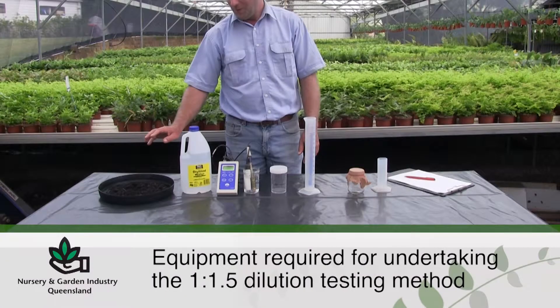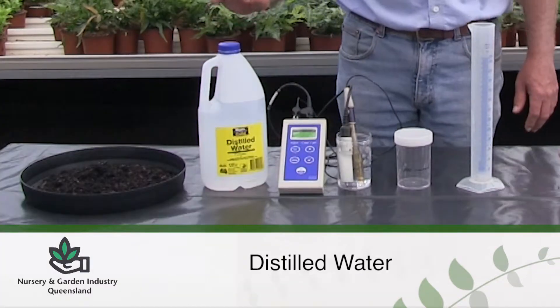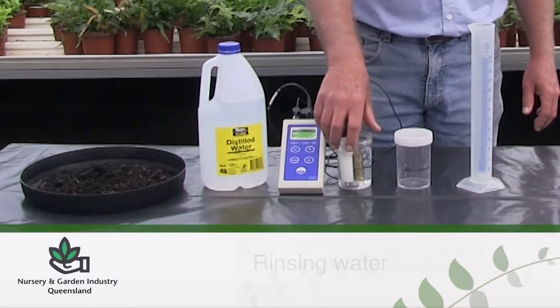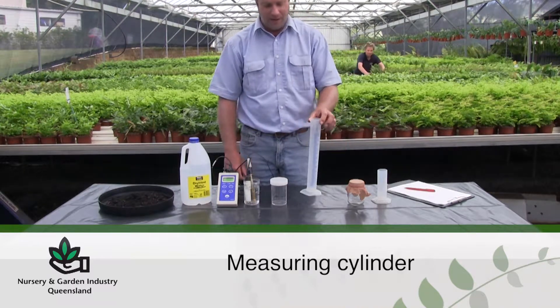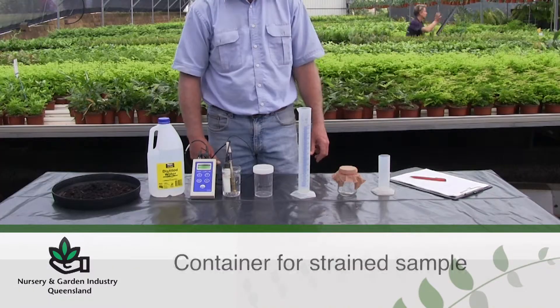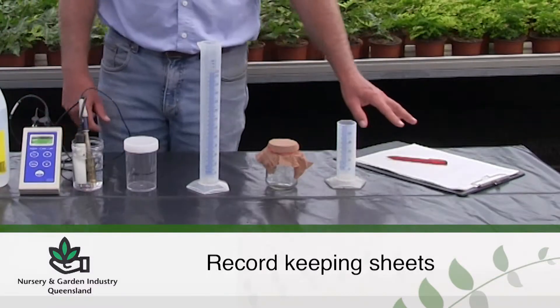The equipment required for an EC and pH test is: a growing media sample, distilled water, a pH EC meter and probes, rinsing water, a measuring container, a measuring cylinder for measuring water, straining equipment which is a container with stocking and rubber band, a container for holding the strained sample, and record keeping sheets.